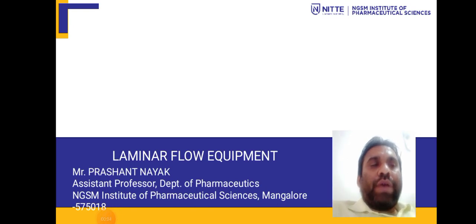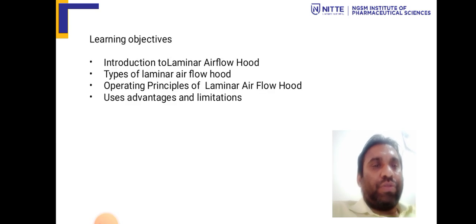Today we are going to have a class on laminar airflow. We will understand exactly what laminar airflow equipments are, how they are used, and for what purpose they have been used. Coming to the learning objectives, first we will see an introduction to laminar airflow hood. Then we will see the types of laminar airflow, how many types there are, the operation principles of laminar airflow, its procedure, and then we will understand its advantages and limitations.